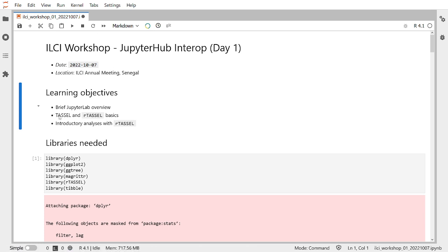So another thing that we went over was rTASSEL. I'll give a brief overview of what that is, and then we're going to go through some analyses with rTASSEL. And this will be basically what we cover for this first video.